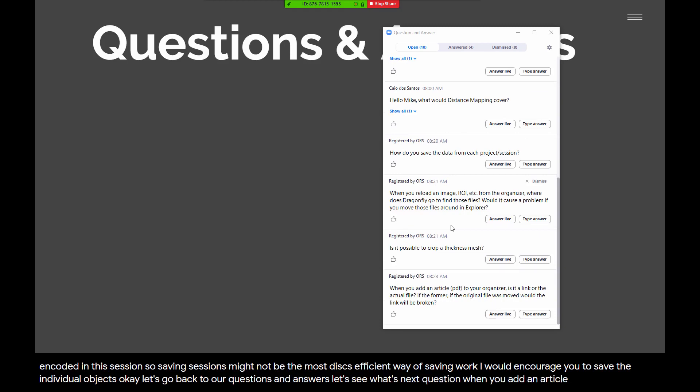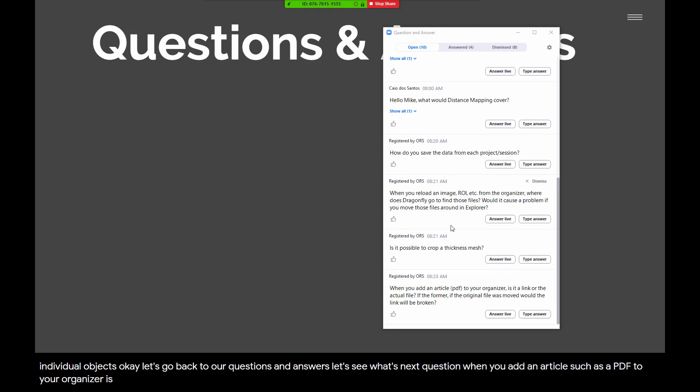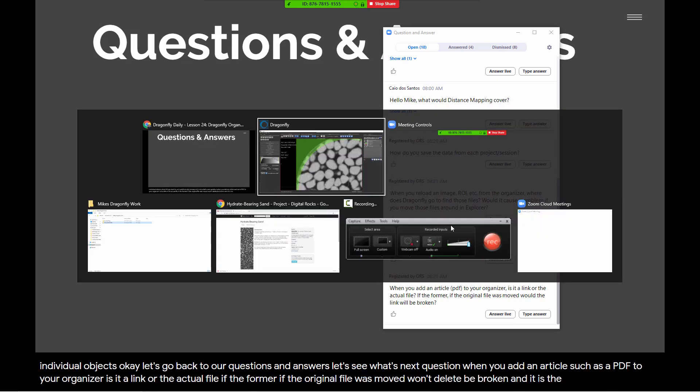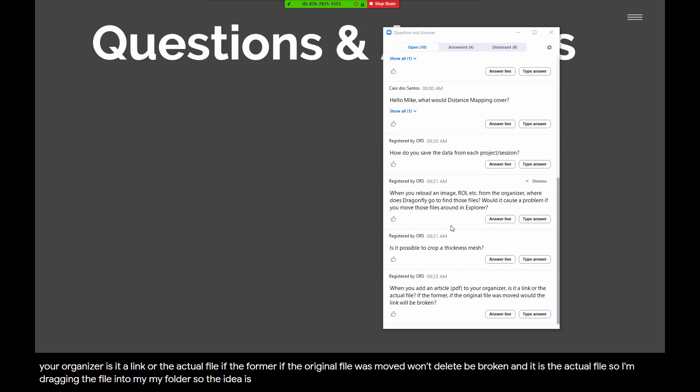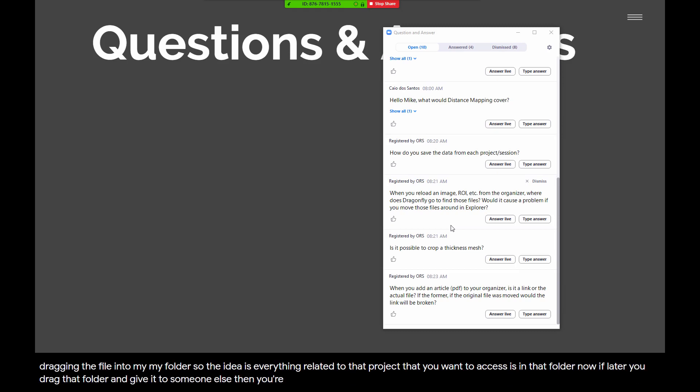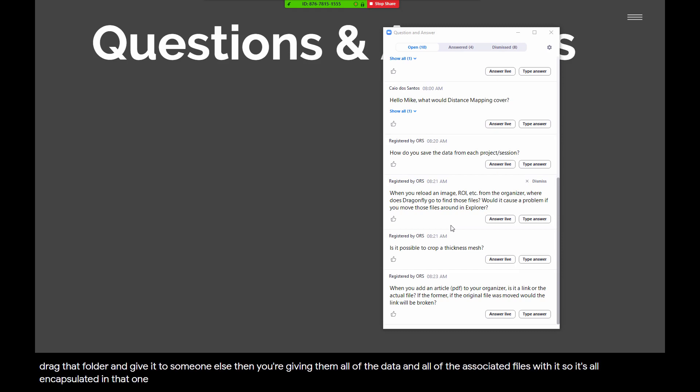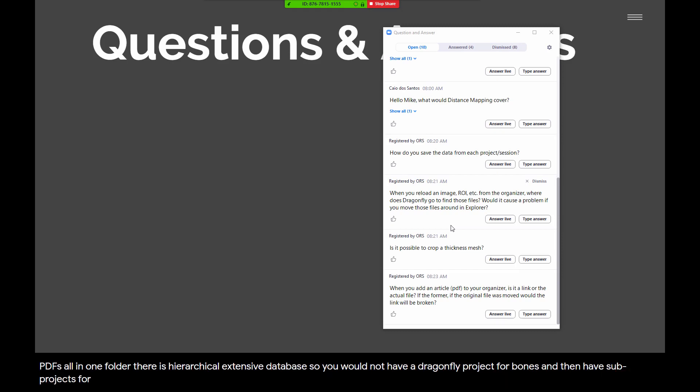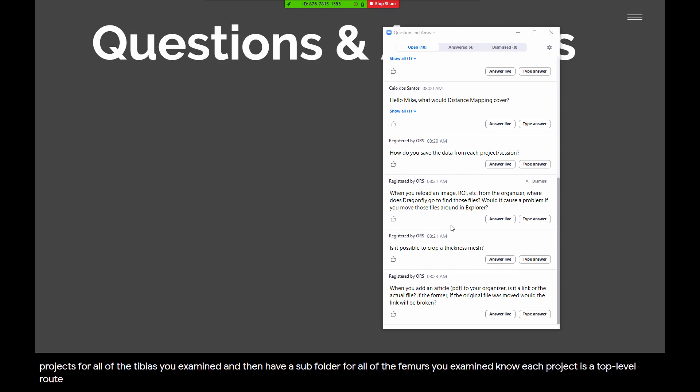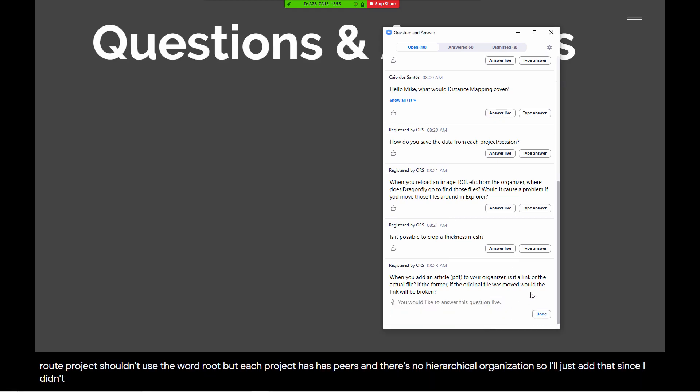Let's see what's next. Question, when you add an article, such as a PDF, to your organizer, is it a link or the actual file? If the former, if the original file was moved, won't the link be broken? It is the actual file. So, I'm dragging the file into my folder. So, the idea is everything related to that project that you want to access is in that folder. Now, if later you drag that folder and give it to someone else, then you're giving them all of the data and all of the associated files with it. So, it's all encapsulated in that one folder. So, the Dragonfly Organizer is all about encapsulating your work, your input data, your results, your associated PDFs, all in one folder. There is no nesting of folders. This is not a hierarchical, extensive database. Each project is a top-level root project. Each project has peers and there's no hierarchical organization.